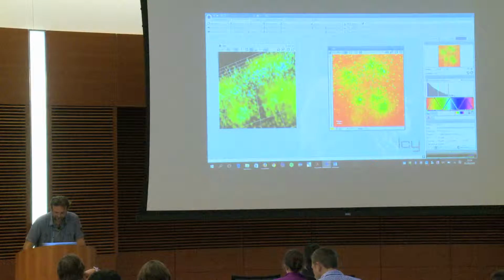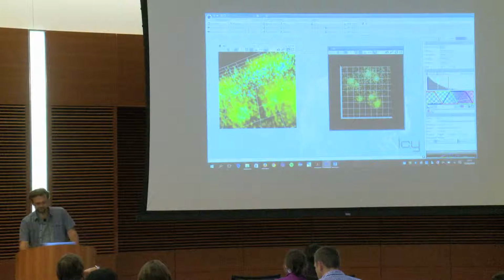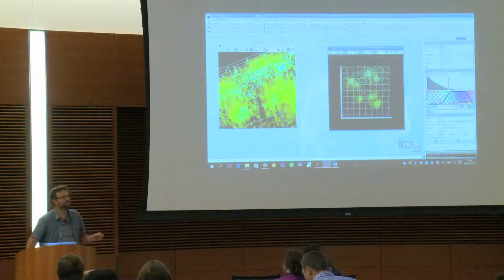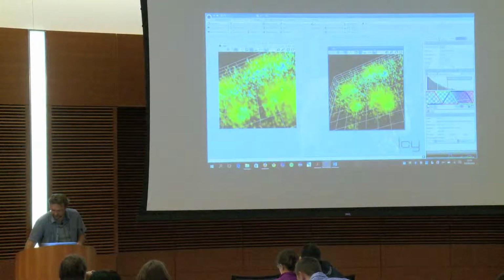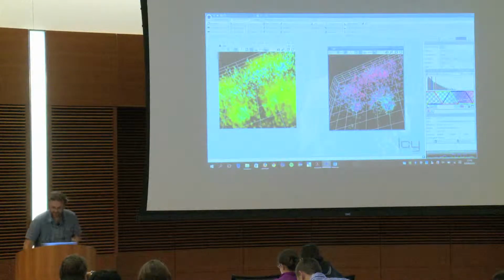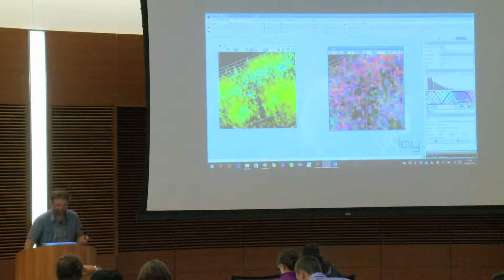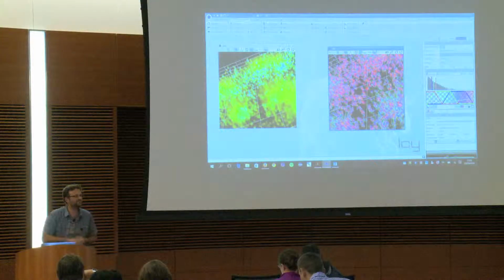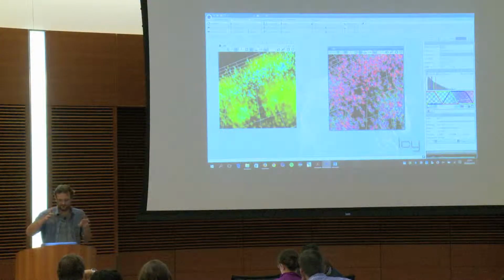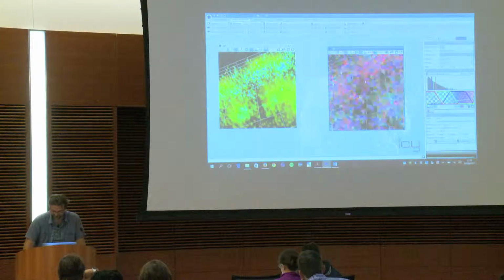And here, if you want to have another view, you just click this view here. It's written duplicate view, but no data. And then you have a second viewer, and for this viewer, you can change the way of representing the data. And you can also check not to have the linear interpolation. When you have little stacks, it's cool because you really see the data. You don't see fake objects or phantom objects that are created because the interpolation is creating roundness with the different pixels.